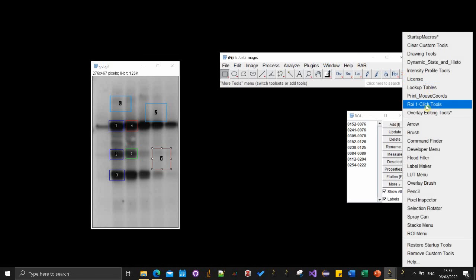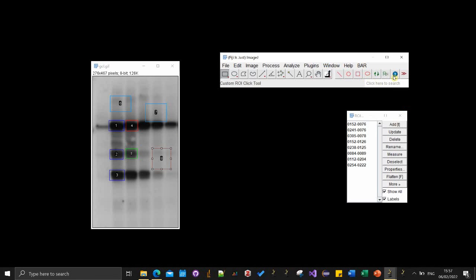So actually, if you use one of my plugin set or macro tools, it also has this keyboard shortcut by default. So now if I'm pressing, actually it's even showing here in this toolbar that it is changing to the value that was typed.